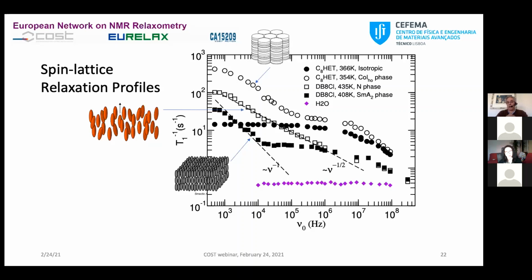They cannot be arbitrarily small. The other thing is that the density of spins cannot change as you wish. It must be a reasonable number. And all this, as well as the average distance between spins in the molecule, cannot be an arbitrary number. So all these features together help the analysis to converge.